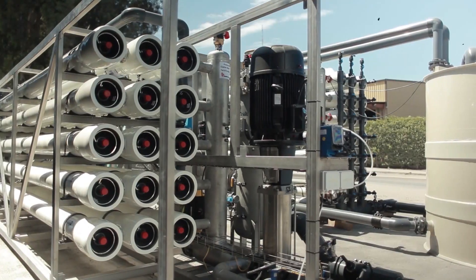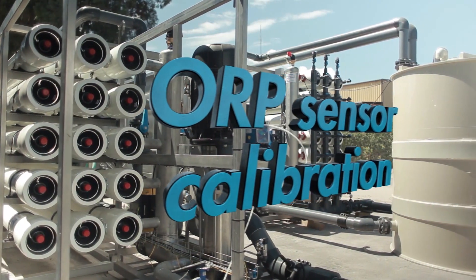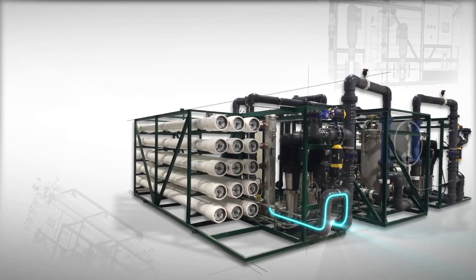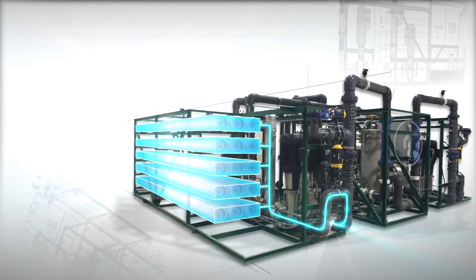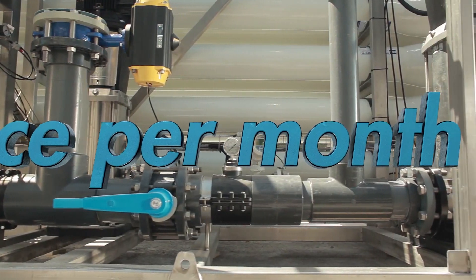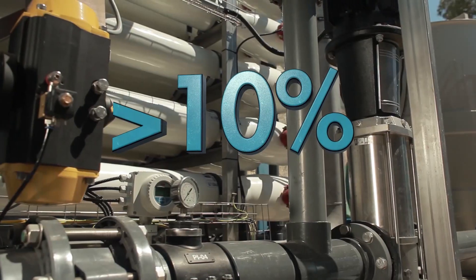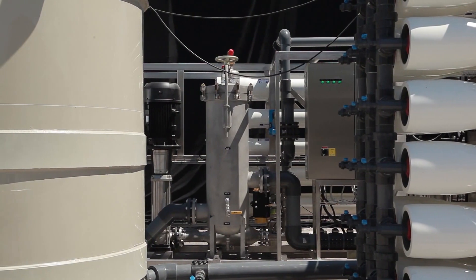The following video offers instructions on how to properly calibrate the ORP sensor. Calibration frequency depends on water quality and the tendency of water to foul the electrode. During the first few months of plant operation, the condition of the electrodes should be checked at least once per month. Calibration of an ORP sensor is required when the difference in reading is more than 10% between a sample measurement and the process ORP meter.